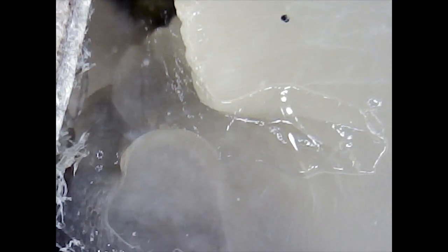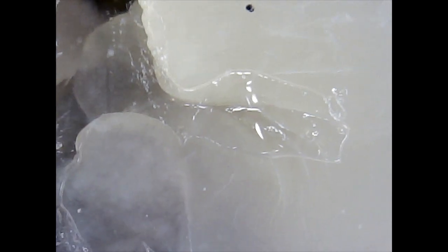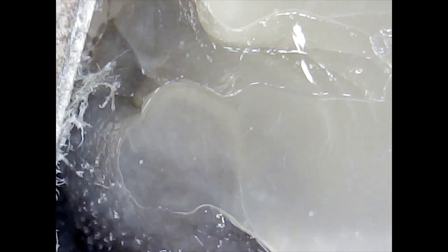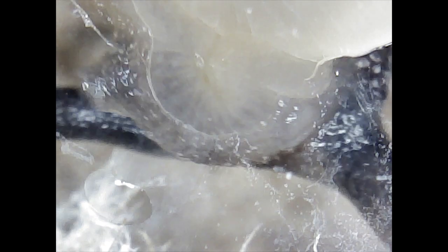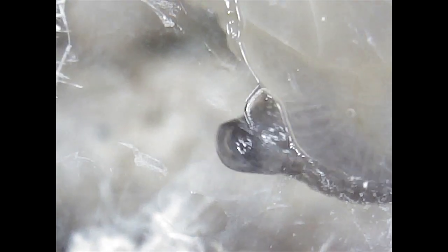Snails, like all mollusks, also have a mantle, a specialized layer of tissue which covers all of the internal organs as they are grouped together in the visceral mass. The mantle also extends outward in flaps which reach to the edge of the shell and in some cases can cover the shell, and which are partially retractable. The mantle is attached to the shell, and creates the shell and makes shell growth possible by secretion.